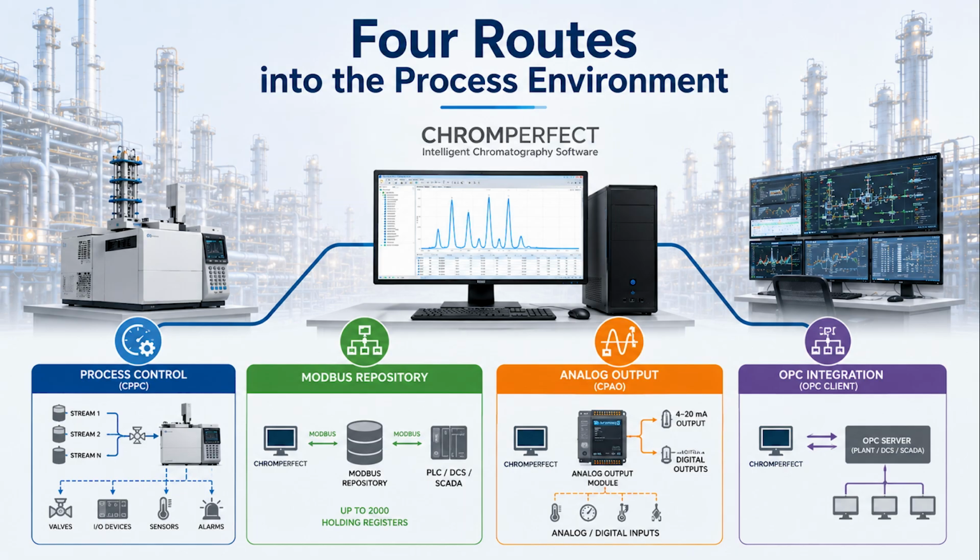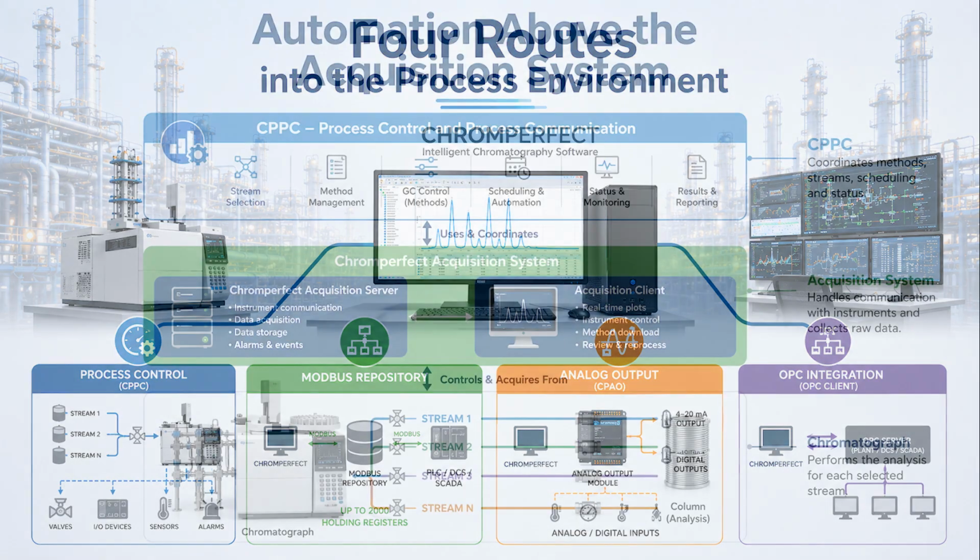The main areas are Chromperfect Process Control, the Modbus Repository, the Analog Output module, and, in some installations, OPC-based communication. These modules perform different jobs, but they share a common purpose: making chromatographic information useful beyond the chromatography workstation.